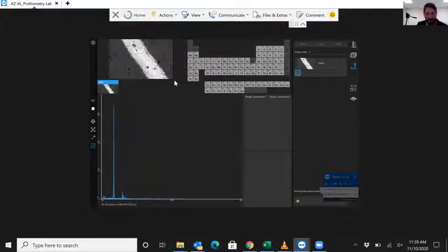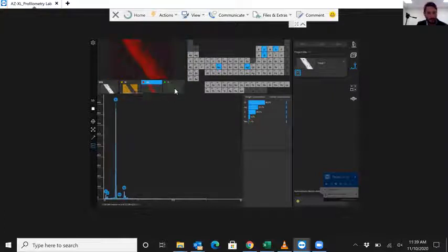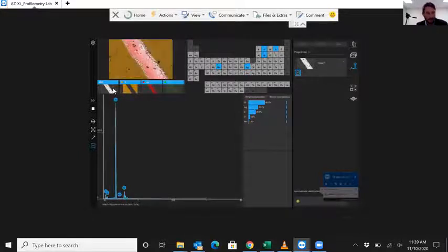This is what we were talking about earlier. The SEM actually has the ability to color code the sample. I'm looking at it on a laptop here, and it's not caught up yet. I'm looking at it on the Phenom, and it's already almost there. It just caught up. So you can see here, we have silicon, we have silver, we have carbon. This is what EDS mapping does. Each pixel in the image, the brighter the color of the pixel, the higher the concentration of the material at that pixel. So that's EDS mapping. Really useful, really cool. And then I can Control A and I can overlay this so you have everything at once. You can change the colors of these things, and so on and so forth.